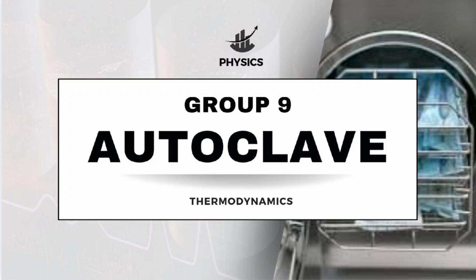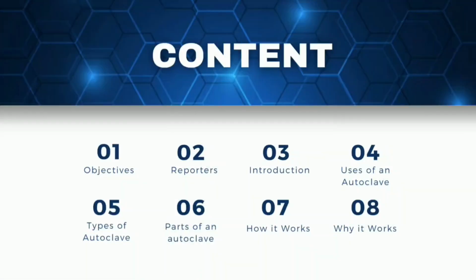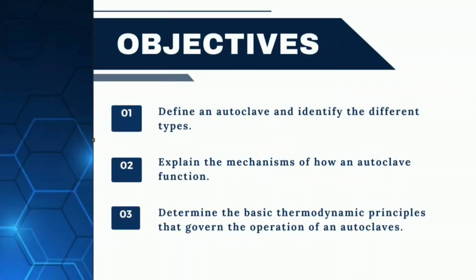In today's presentation, we are going to discuss all about autoclaves, its types, its practices, and of course its principles. Listed here are the contents found in this presentation. Presenting to you the objectives of our lesson.